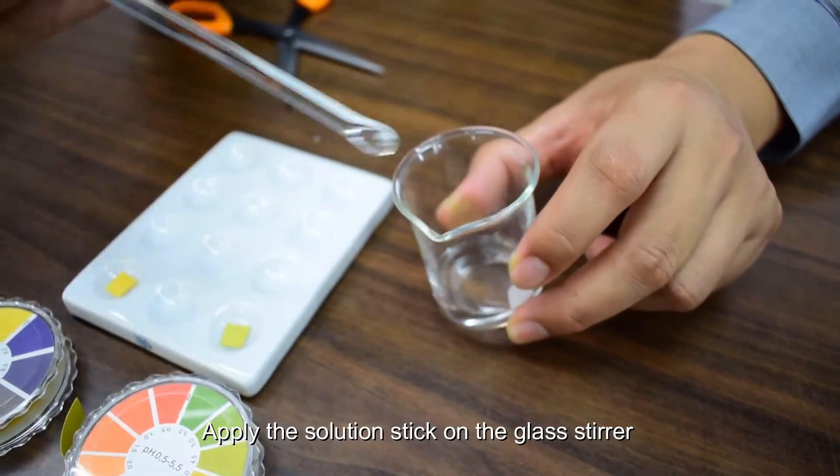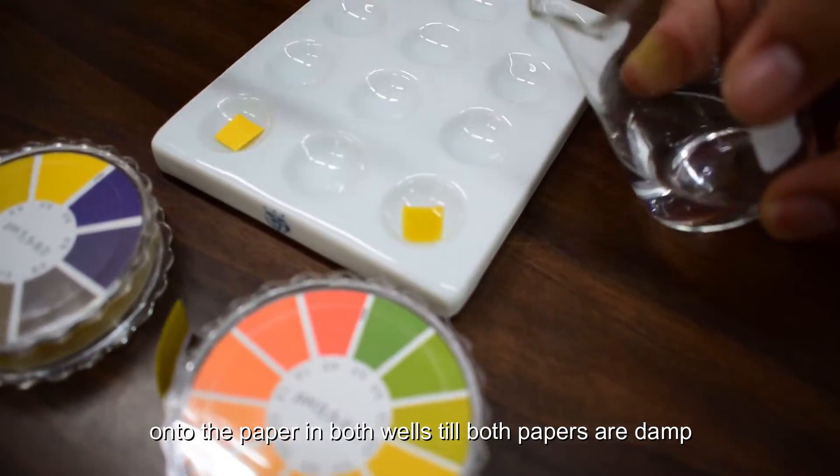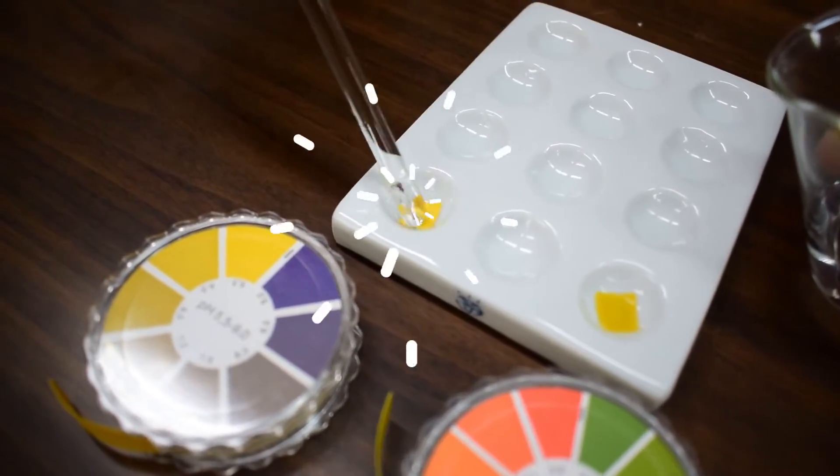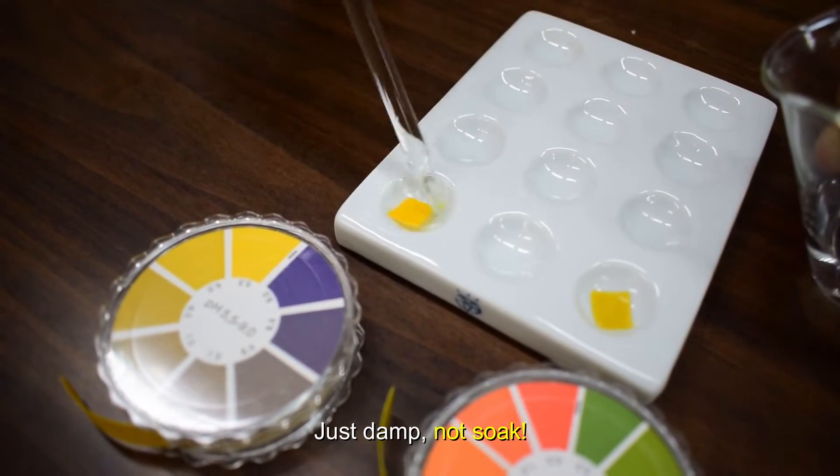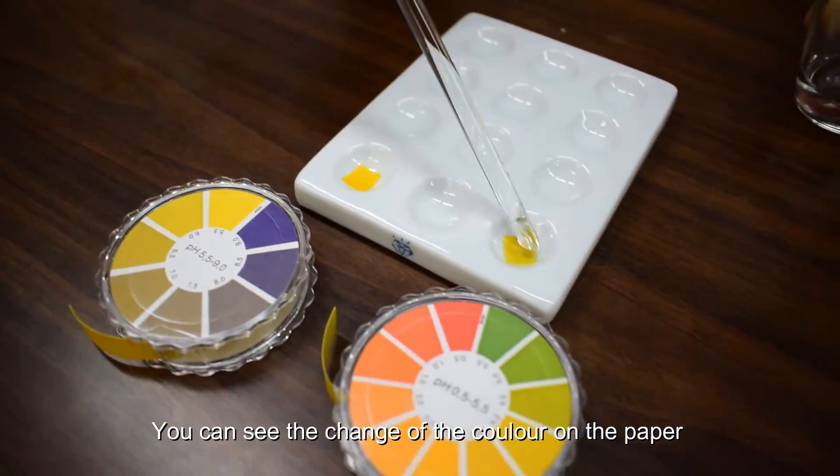Apply the solution stuck on the glass stirrer onto the paper in both wells till both papers are damp. Just damp, not soak. You can see the change of color on the paper.